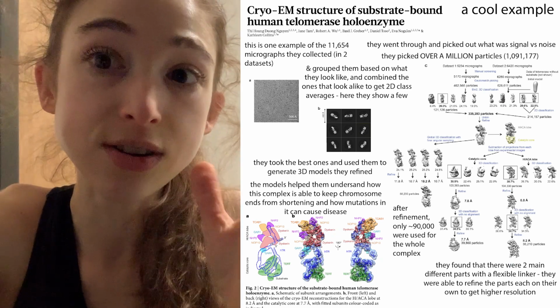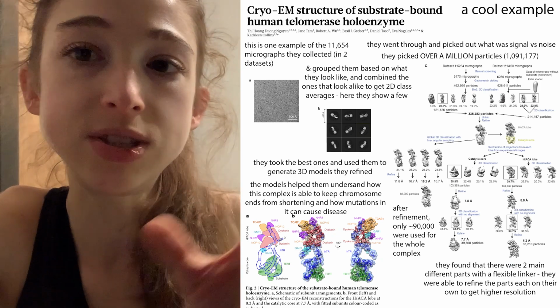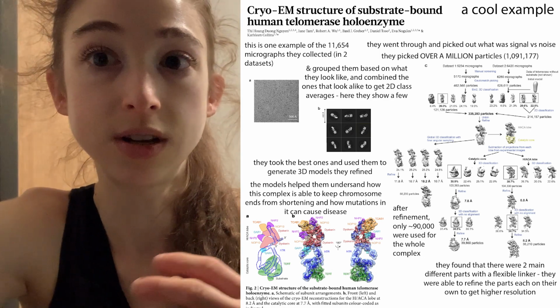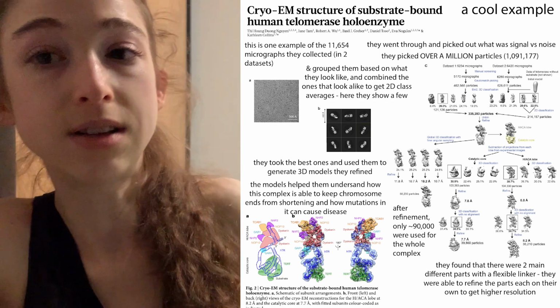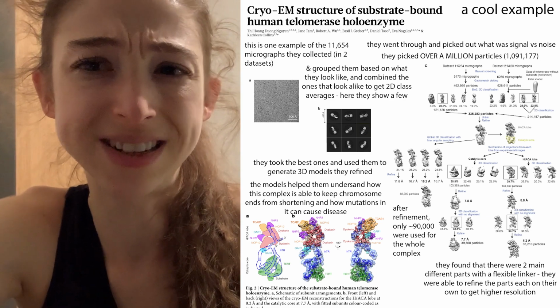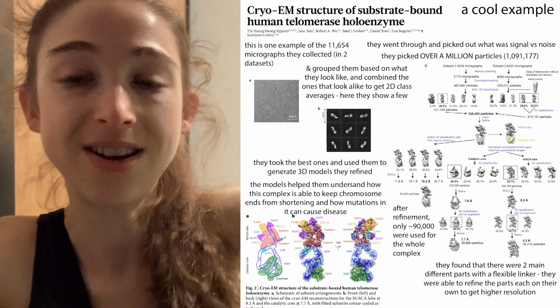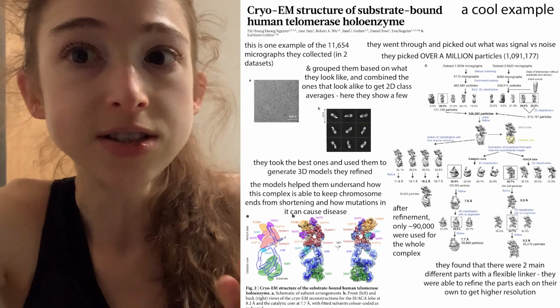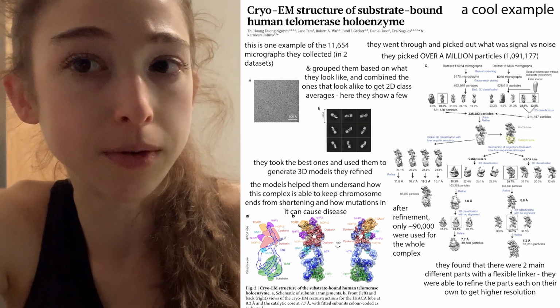And so that's another classification that you can do. You can tease out which of them are doing a handstand and which are laying out straight, or I guess those would be kind of similar, but which of them are doing a star versus an L or something like that. So in this way, you're able to see multiple conformations.